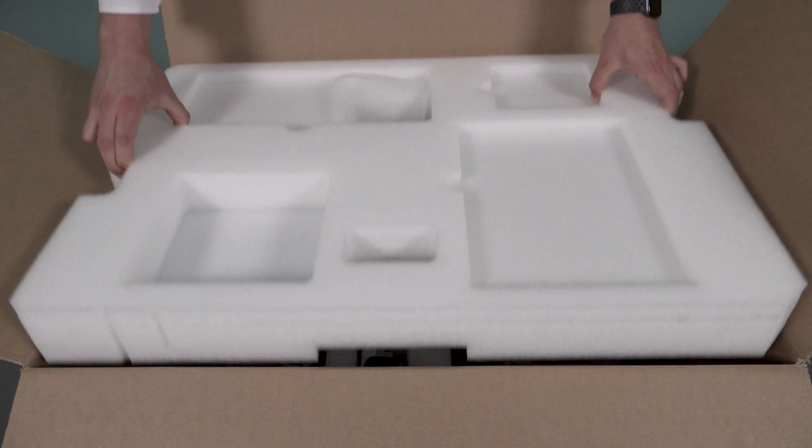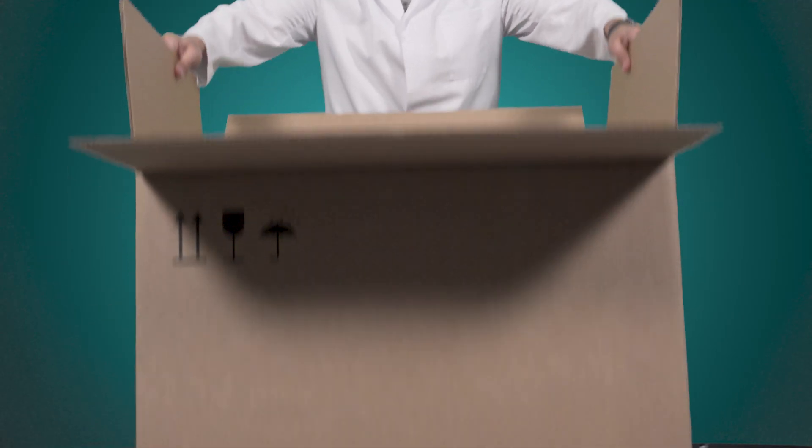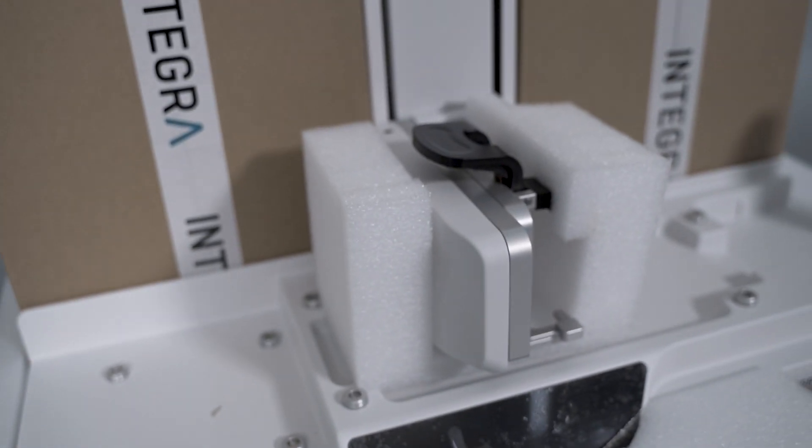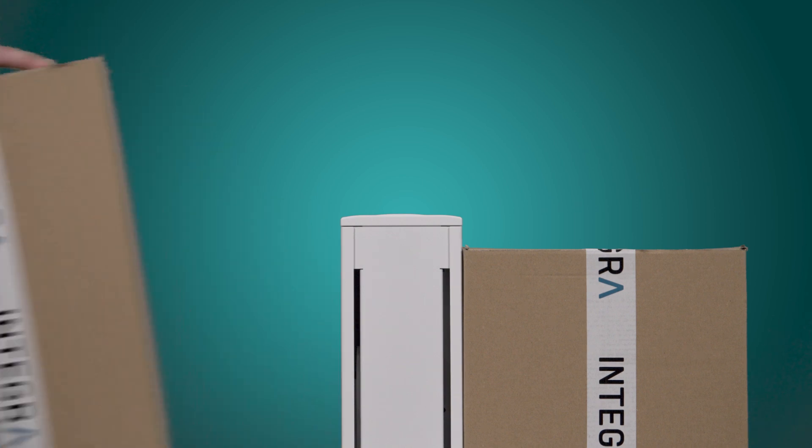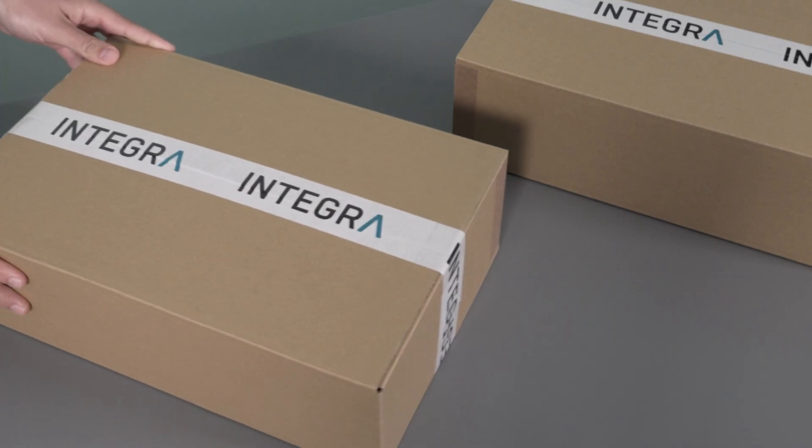Finally, take out the transport protection foam. Remove both accessory boxes, the outer carton box, and the two carton shields.